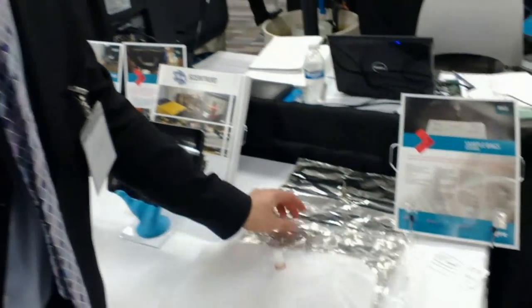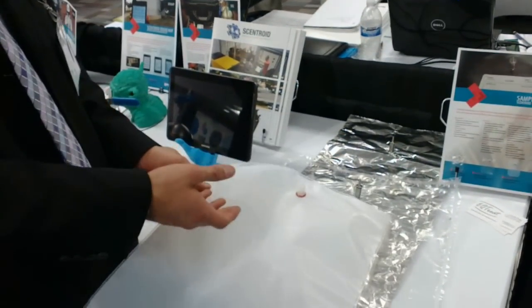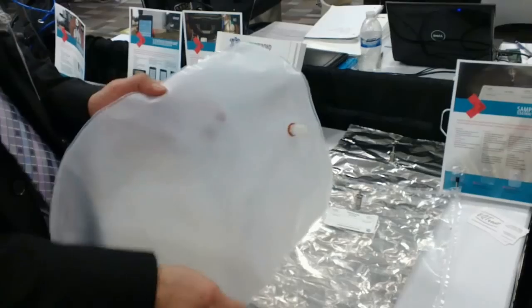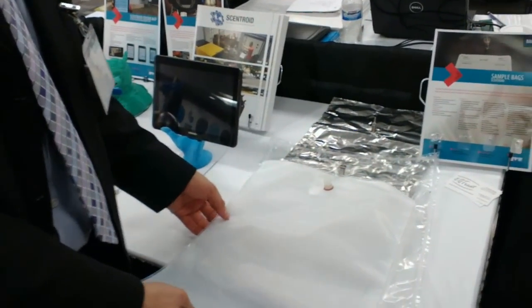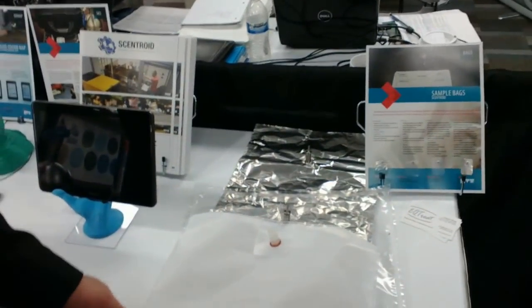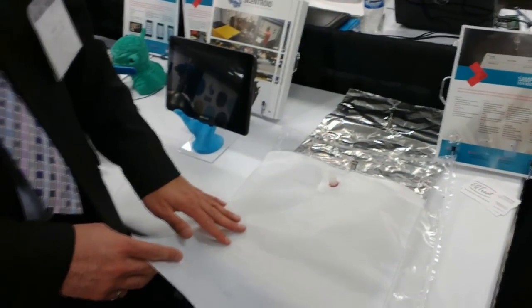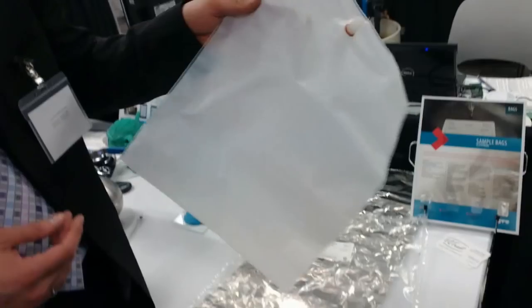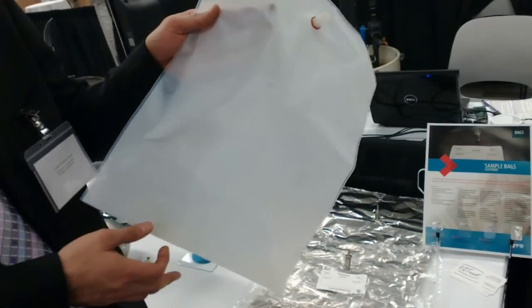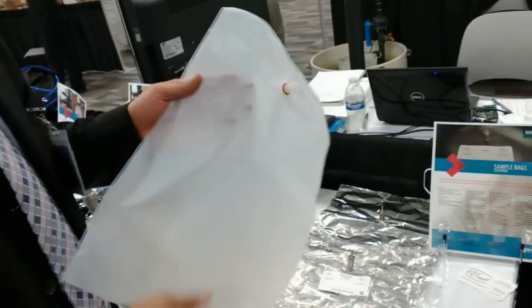Nullophane would be about $8 or $10, but it's a one-time use. This one you can use as much as you want — the odor doesn't stick to it. So you can empty it out, fill it with some air and empty again, and then you're ready to go again. We sell it in Canada to some laboratories and they reuse it a lot. You can also put it in an oven to clean it, but they said they don't need to — they just purge it once with air and that's it.